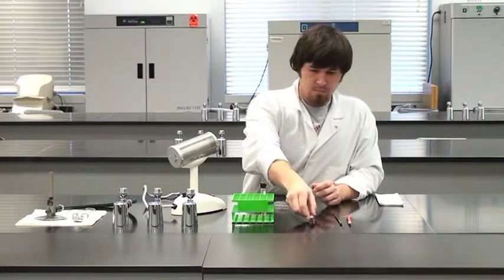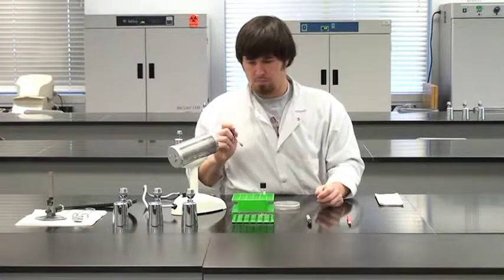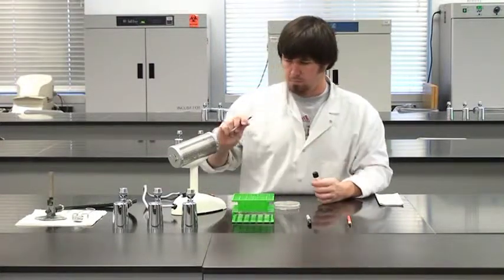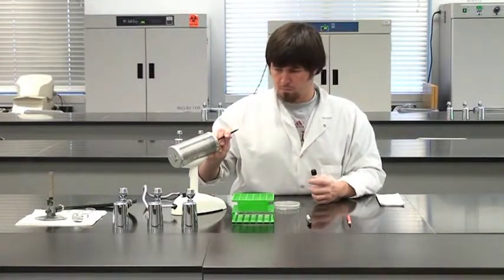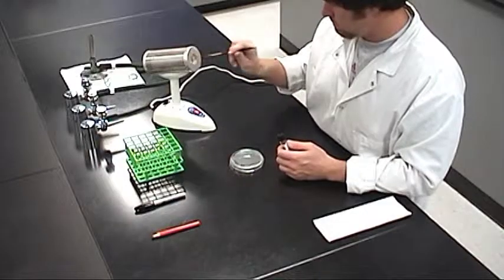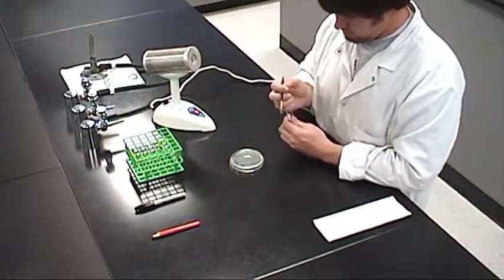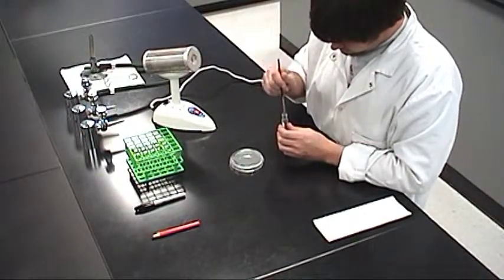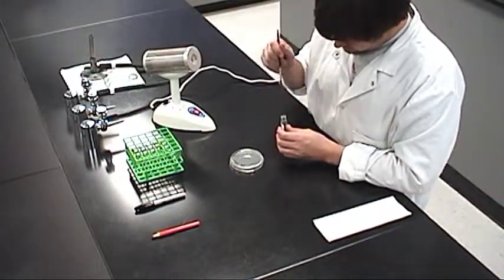Next, inoculate the streak plate using an inoculating loop. Flame the loop for at least 5 seconds to sterilize it. Then extract a single loop full of culture from the culture tube.